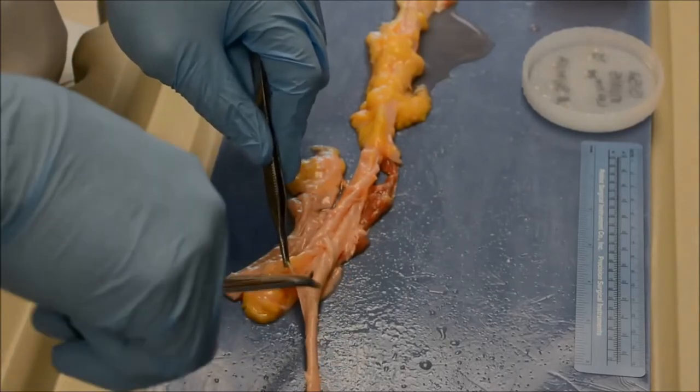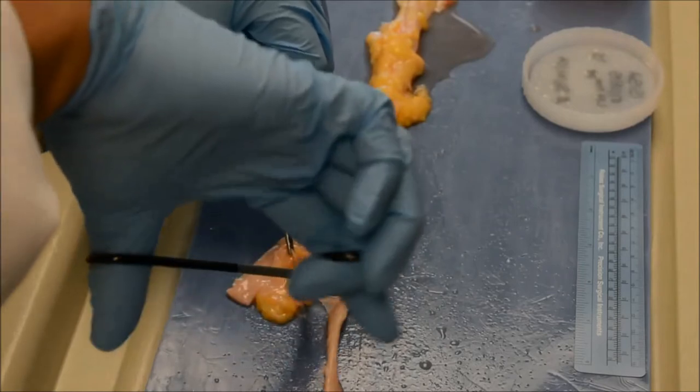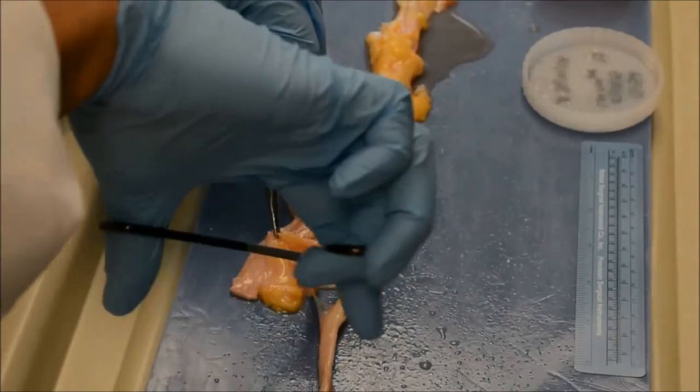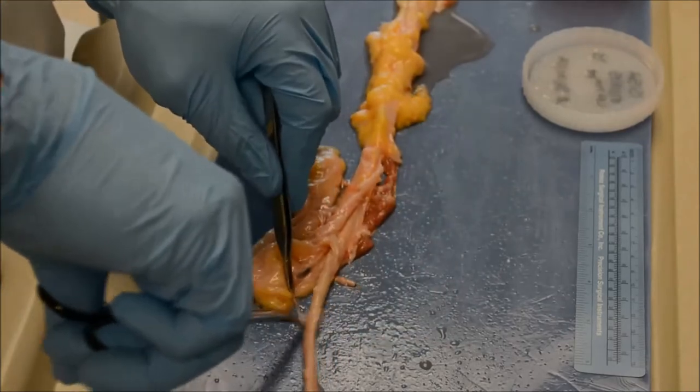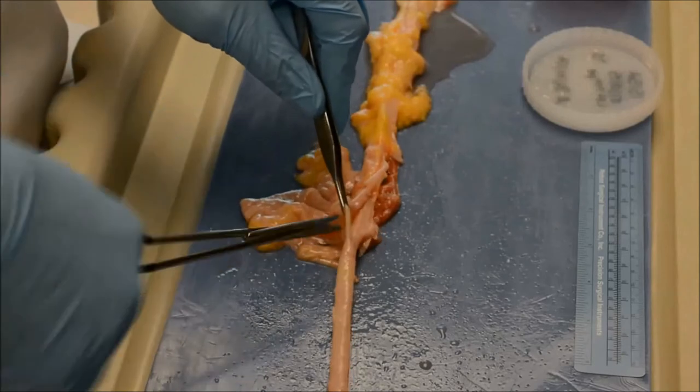Since human arteries have different properties in different directions, multi-axial testing is generally preferred over uniaxial tests. In addition, rich data from multi-ratio protocols covering the entire strain space is beneficial for constitutive modeling and finding unique parameters corresponding to each tested sample.